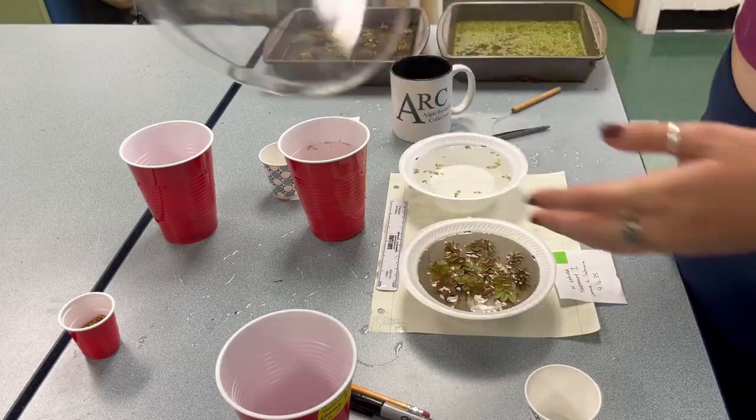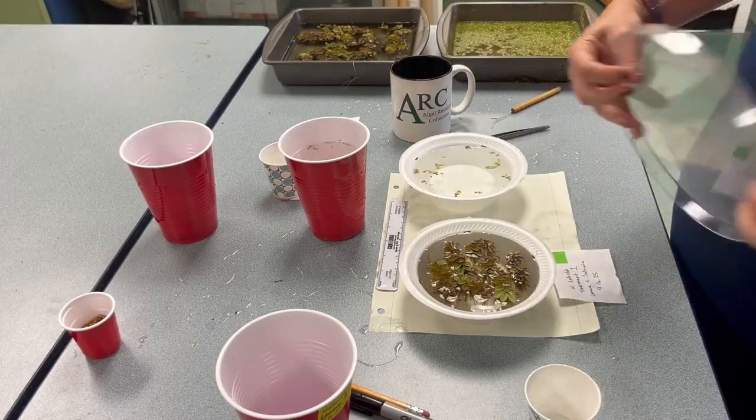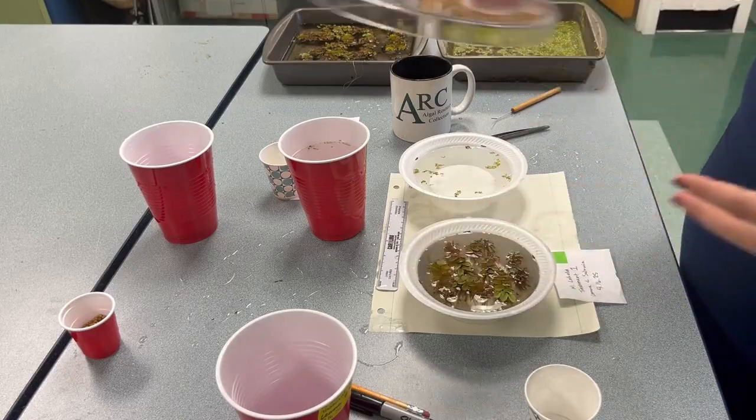So yes, just be careful. If you do the grid method, when you are taking the photos, take the photos without the grid, and then do the grid after the fact.